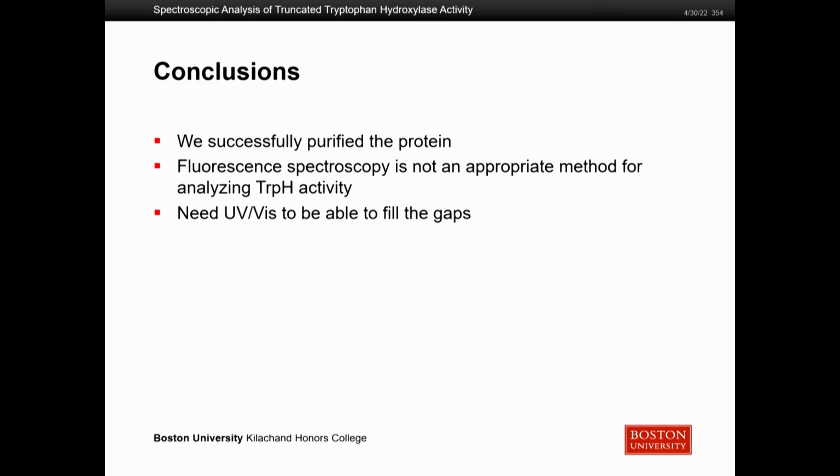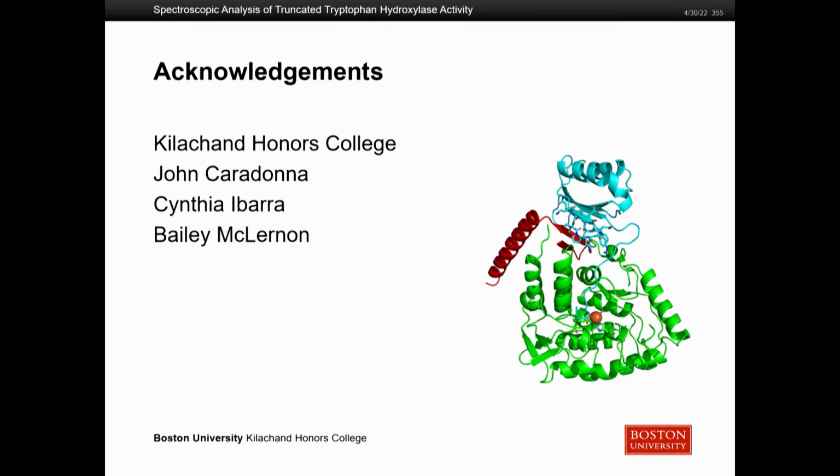So in conclusion, we were successfully able to purify the protein. We determined that fluorescence spectroscopy was not the appropriate method for analyzing this enzyme's activity, and we determined a need to turn to a different form of analyzing this enzyme to be able to fill the gaps that fluorescence could not. I'd just like to thank KHC, my advisor, John Caradonna, and the other two members of our lab, Cynthia and Bailey. Thank you.